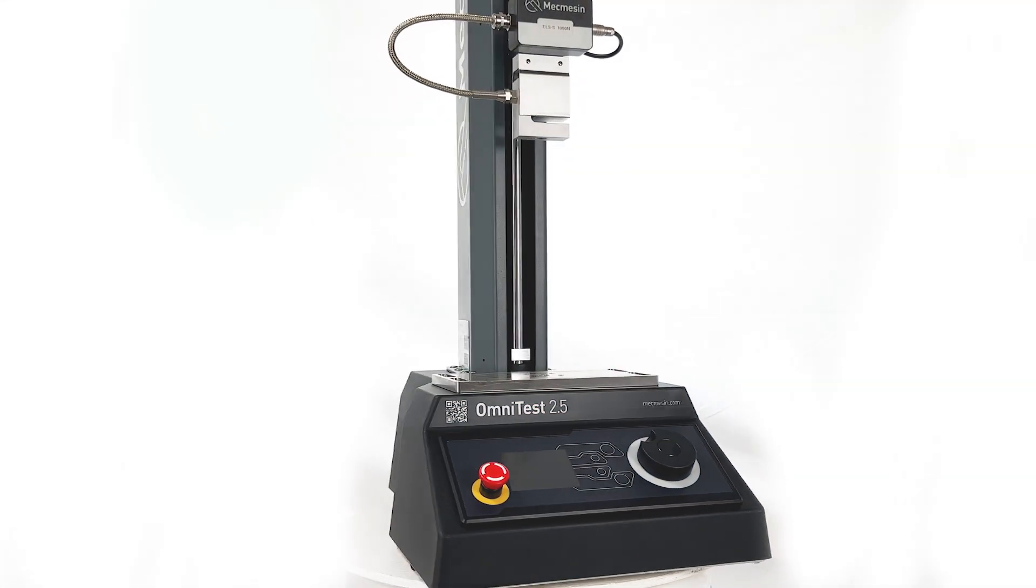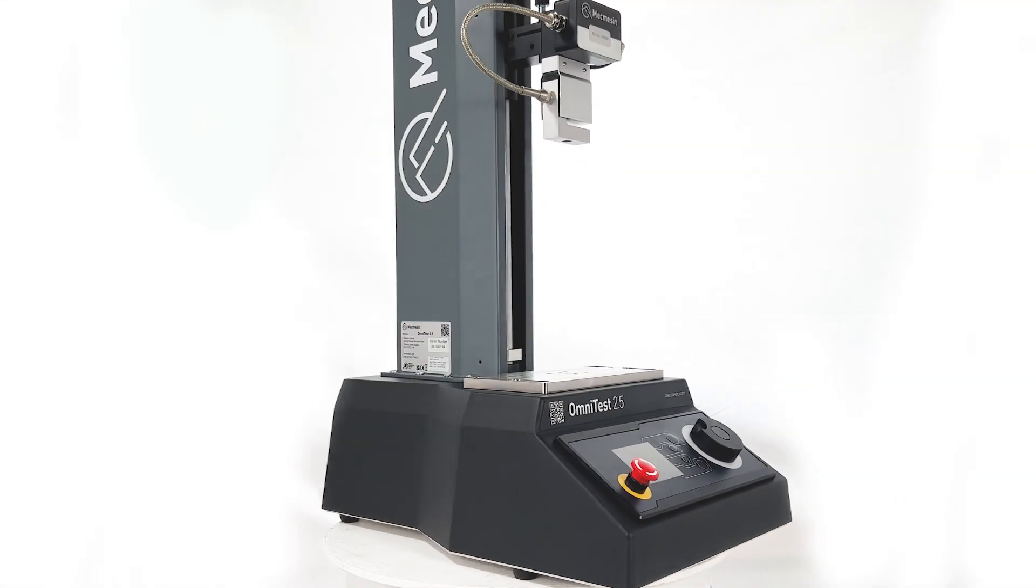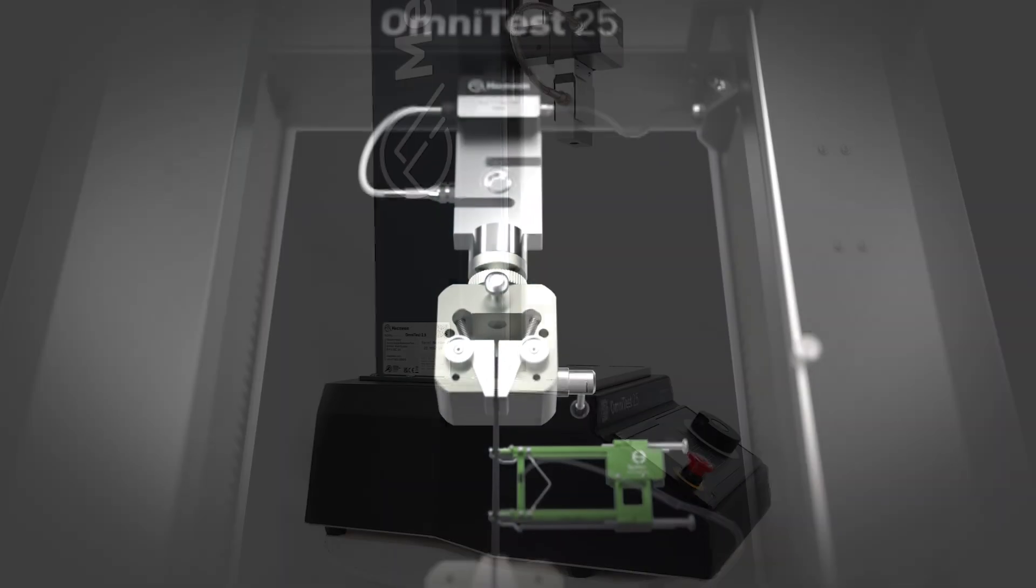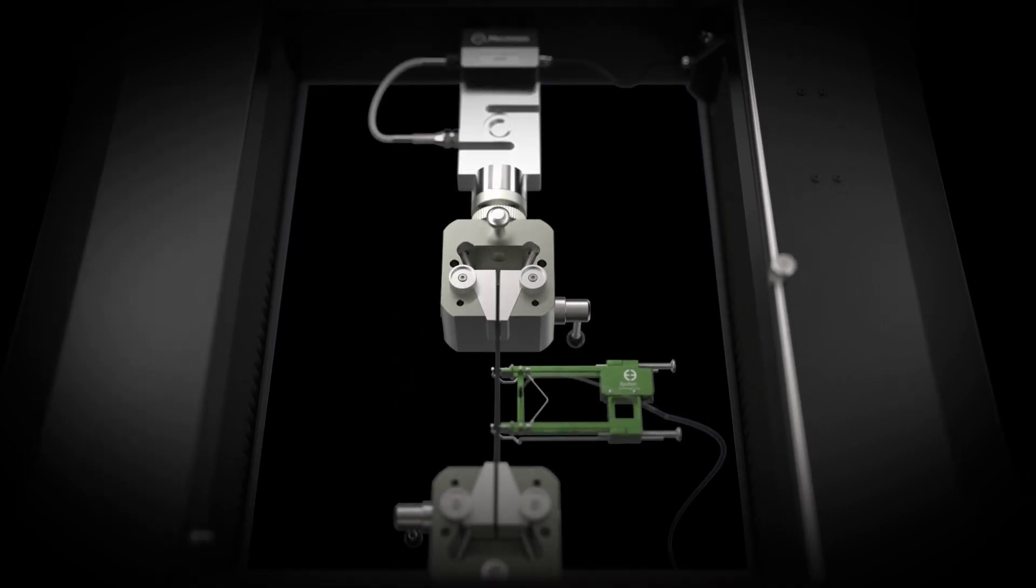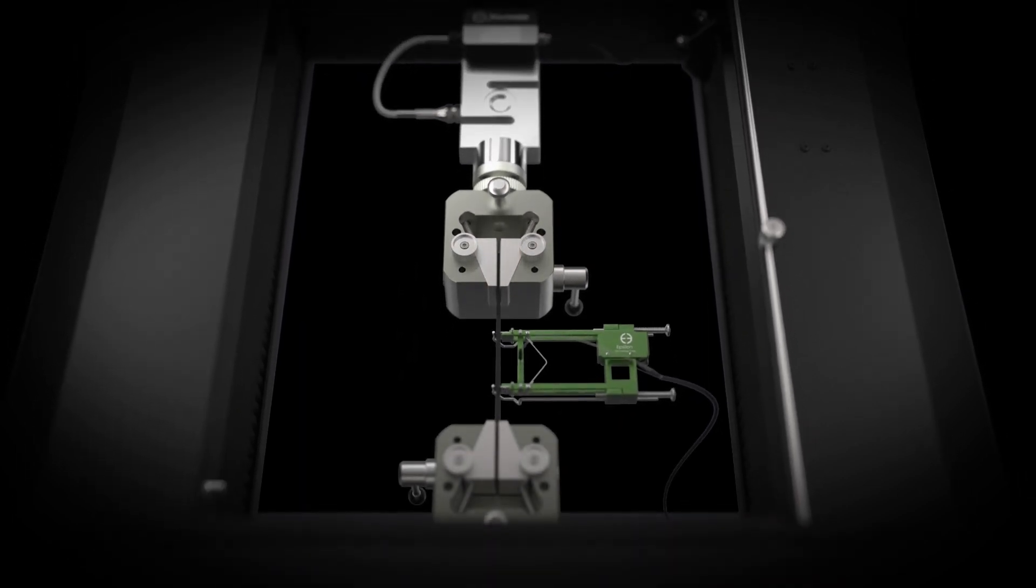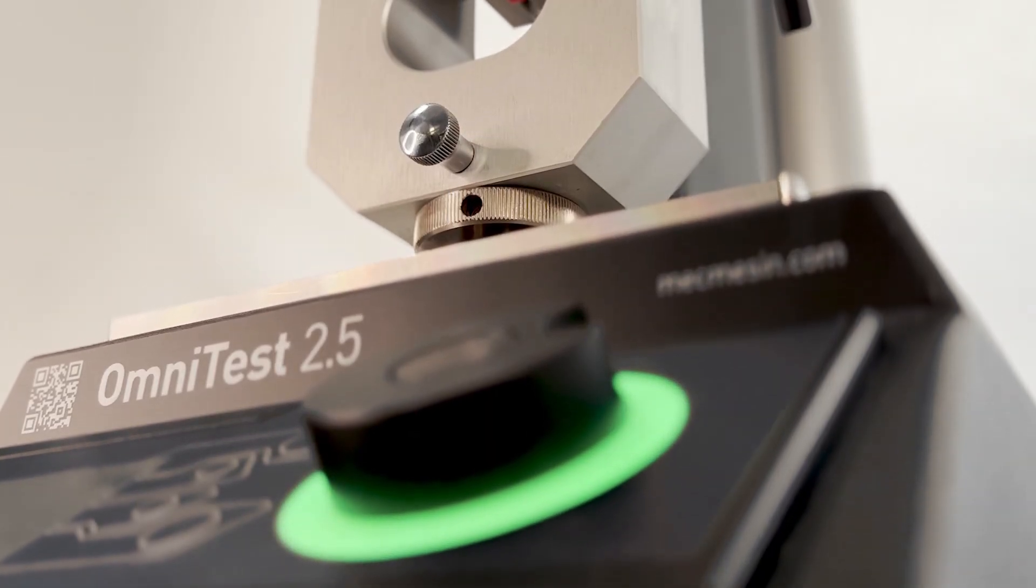Mecmesin's new Omni test range of universal testing machines are designed for tensile and compression testing of materials, products, and components.